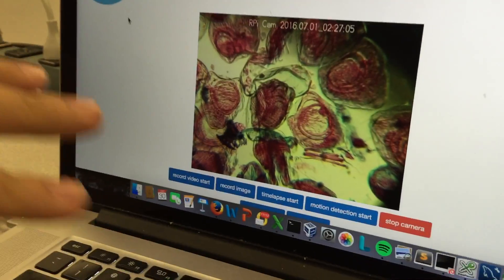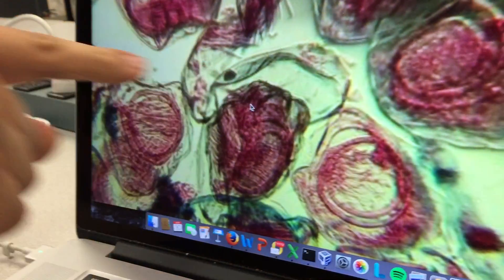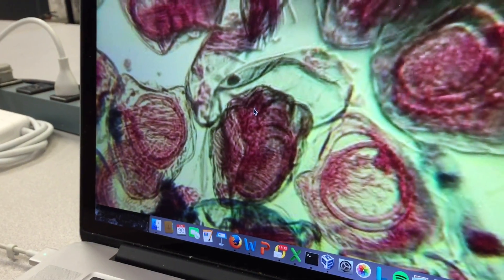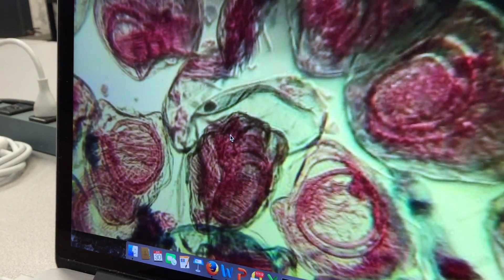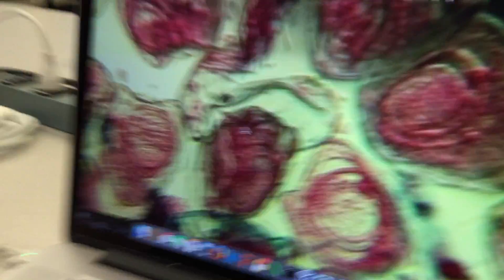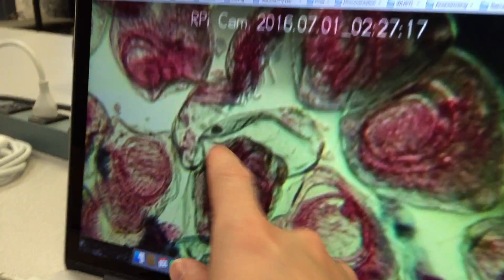So you've got very granular control and you can really dial it in to get some very good focus right here. Yeah, you can start seeing the hooks of the mollusk larvae or whatever.